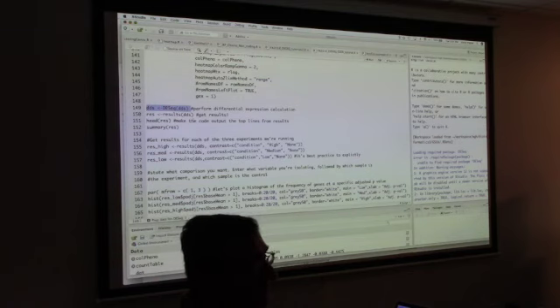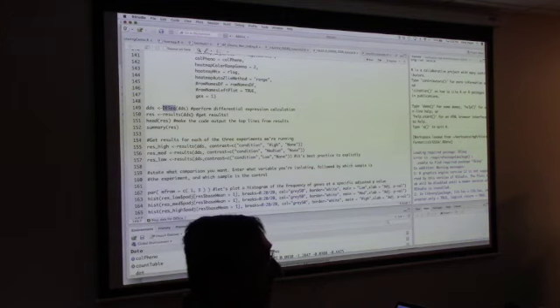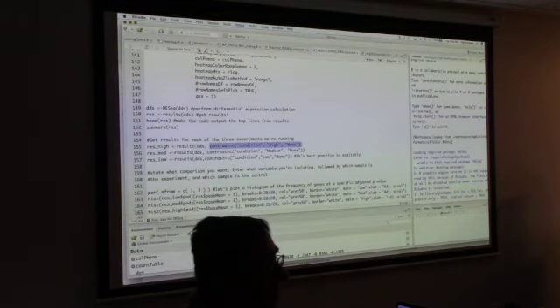Yes. I have a question. So for the DESeq dataset, for example, you not only have control, but maybe you have condition 1, condition 2, and 3, and then you do the res. So you specify the contrast. So what's the p-value then calculated for the fold change? If you have more than one factor and you're not specifying the result that you're looking for, it's going to compare the first two, right? But that's the reason why I say that you have to specify like results high, results medium, results low. You have to specify your contrast, saying which two conditions you want the results for.